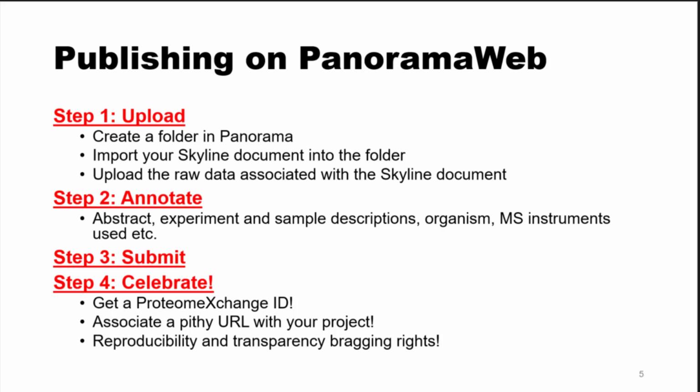I have talked to a couple of you now about looking at the data, like, what if the data looks like junk? What if my chromatograms just look terrible or my spectra just look terrible? When you use Panorama in this way as a community, not necessarily that you yourself have to upload all your data, you can use other people's data. And maybe someone makes a claim in a paper and you're like, I don't really know if that peptide or that protein is really regulated differentially. You can look at their chromatograms and make that judgment yourself.